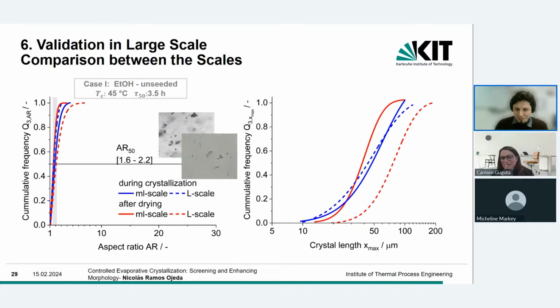You had the image of the crystalline with the cameras. And then in the liter scale, we were limited. We don't have a zone to explore that inline. But what we tried is to take the samples at the same conditions, keeping the temperature constant, place the suspension in a crystalline vial, and those vials immersed in the crystalline at exactly the same temperature.